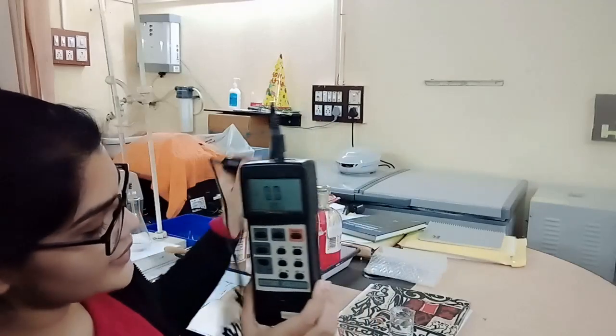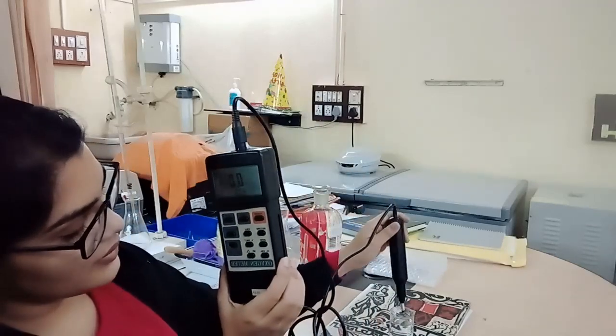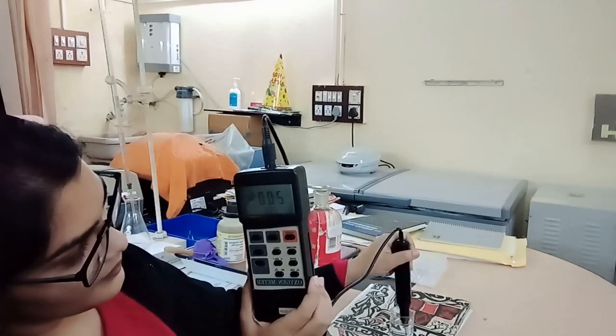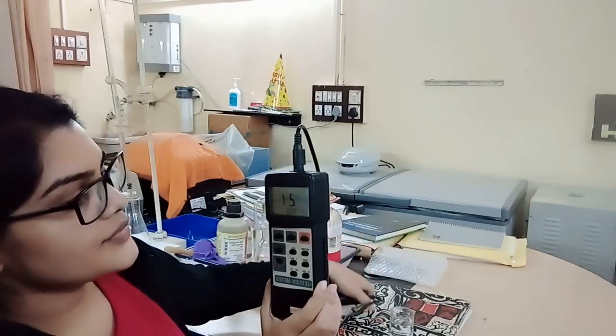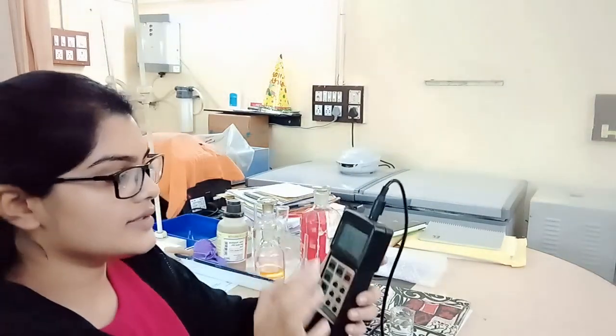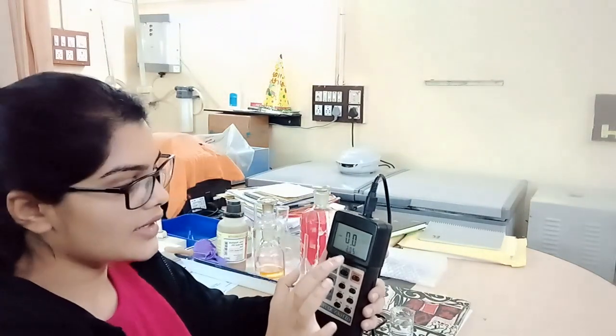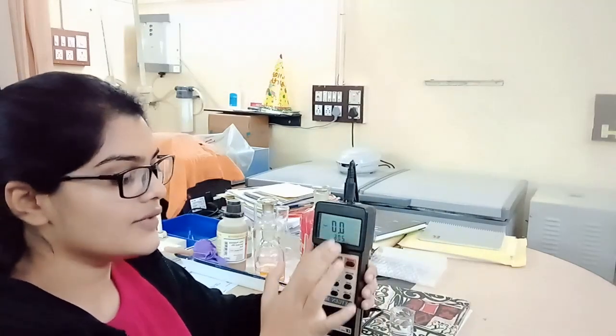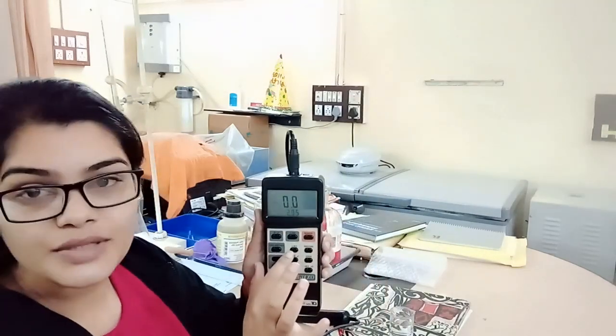So now I will dip it into the water, and you can get the reading here. As we have seen, we are getting the result here, and this is the temperature below, and the reading we can calibrate by this calibration button.